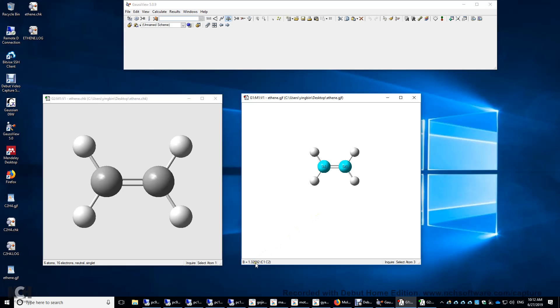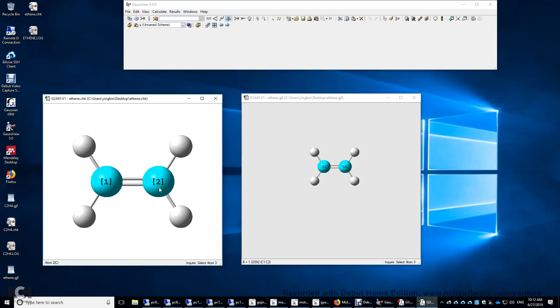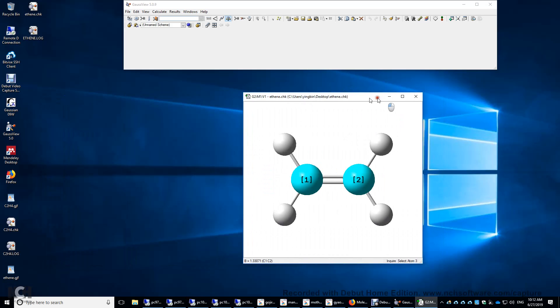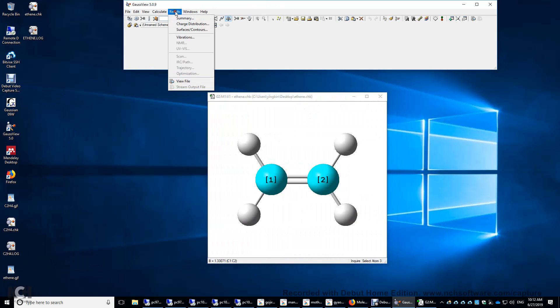1.325, 1.330. So indeed, the bond distance is optimized. All right. Check file. And then let's look at the results.